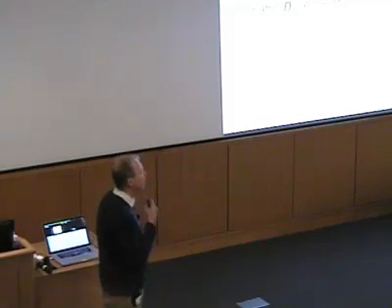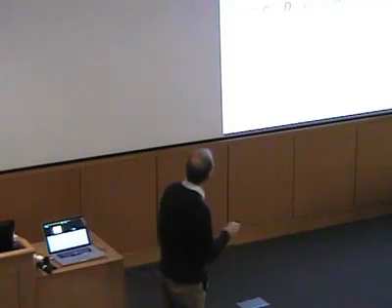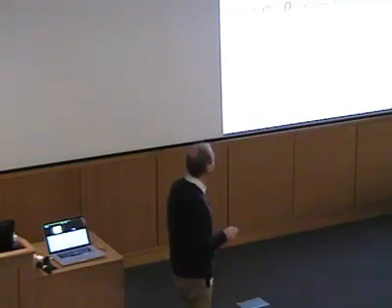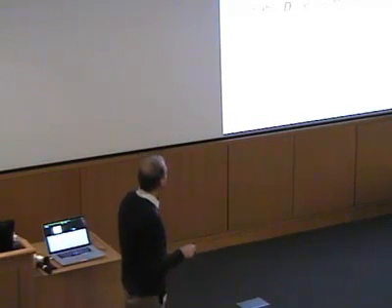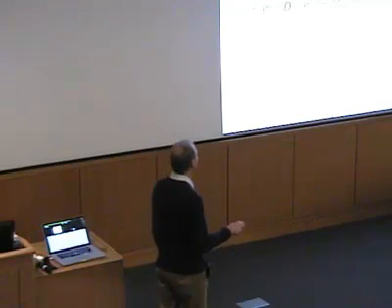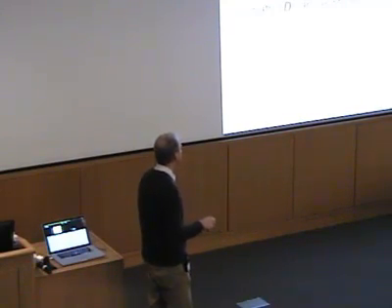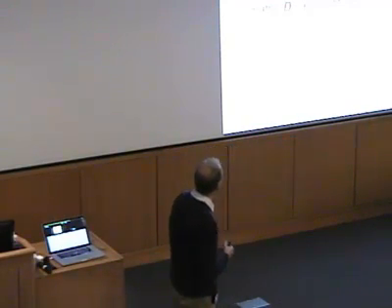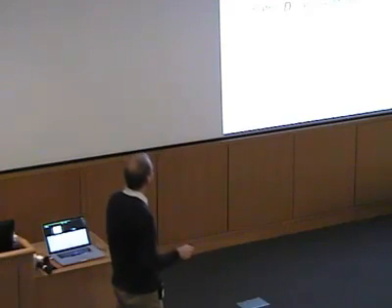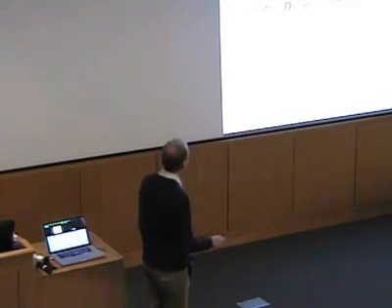So the way that we describe the zero field splitting, I'm not going to go through the quantum mechanics of it in any great detail, but if you were to write down the Hamiltonian for this interaction, it appears as a term which looks like this, where S here is the spin operator in matrix form, and then there's this matrix D which describes the interaction. Okay? And so if I set this matrix up in its principal axis system, it would look like this.